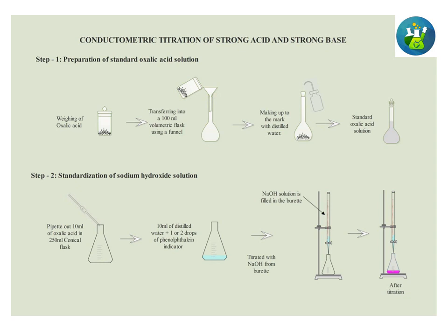So when you titrate by adding NaOH from the burette into the conical flask, the end point is observed by the color change from colorless to pale pink. Colorless in acid medium. Phenolphthalein is colorless in acid medium, whereas phenolphthalein is pink colored in alkaline solution. Using the formula M1V1 by N1 is equal to M2V2 by N2, you will be calculating the concentration of sodium hydroxide solution.